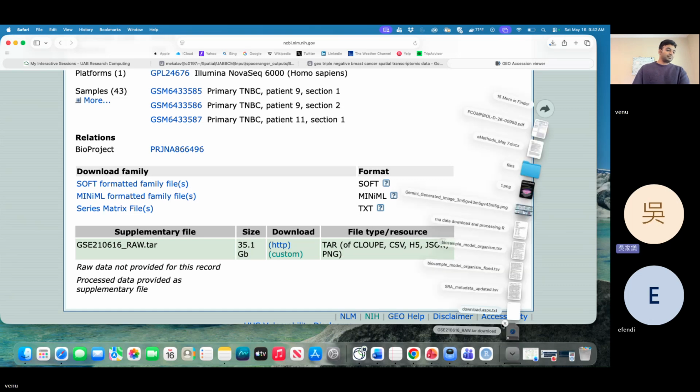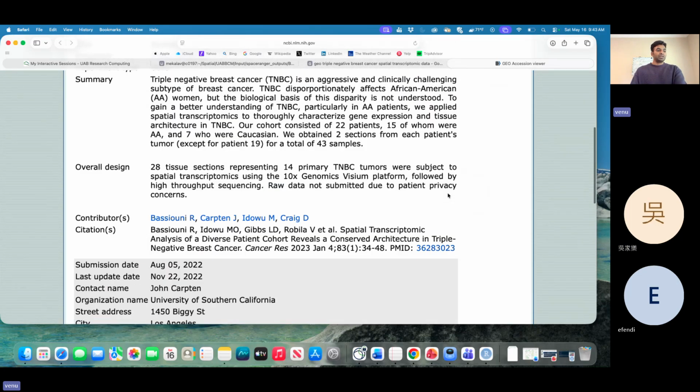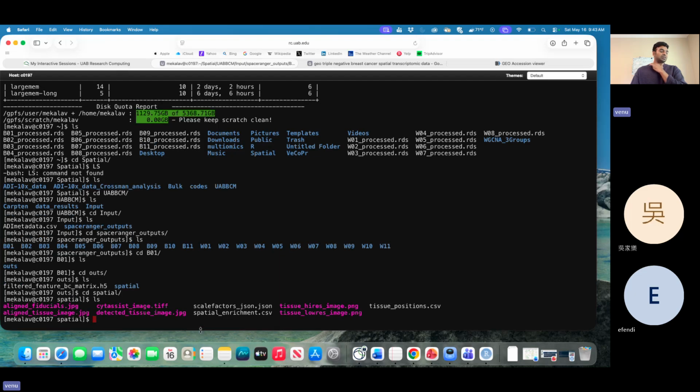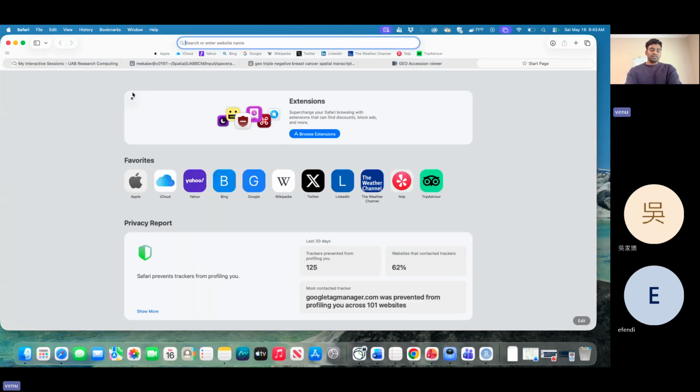Okay, so download options. We can download the data and use it, because most of the time, if I use a local computer, it may take a little longer to analyze. Supposing an HPC computer takes 4 days, here it may take 10 days. But we can cut down these days because there are many integrating methods right now.